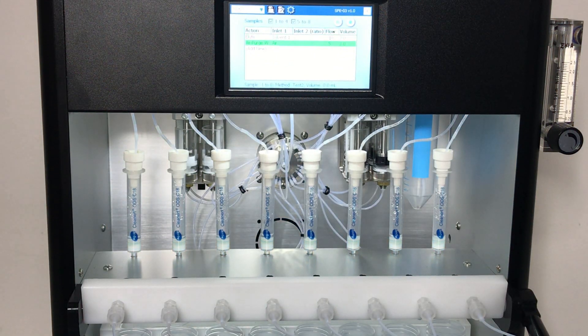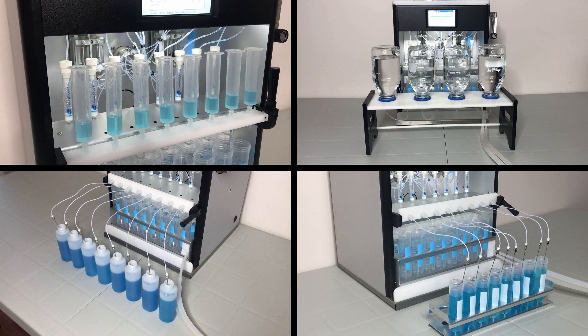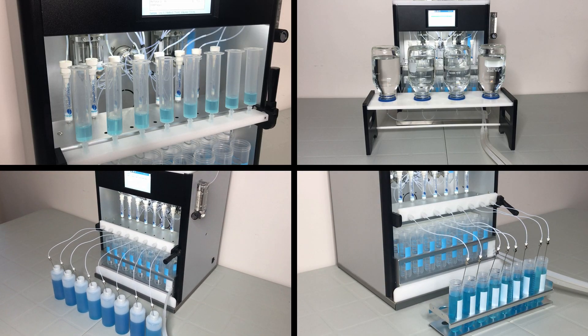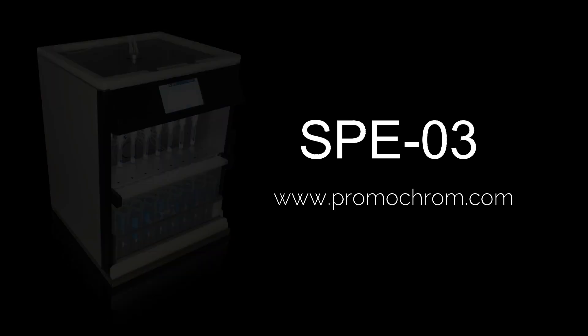If you're looking for a system to speed up sample preparation, produce repeatable results, and have the flexibility for different applications, the SPE03 is the solution. For more information, visit our website at www.promachrom.com.